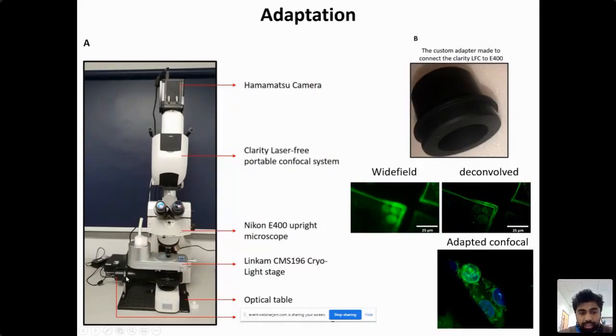So we attached a motorized focus knob Z controller. This is completely motorized, and now we can do optical sectioning at the nanoscale or submicron scale. Currently, we're also fitting an automated Linkam stage that will allow automated tile scanning and capturing a correlative map of our whole image sequence, and then we can use that to map between instruments such as the electron microscope.